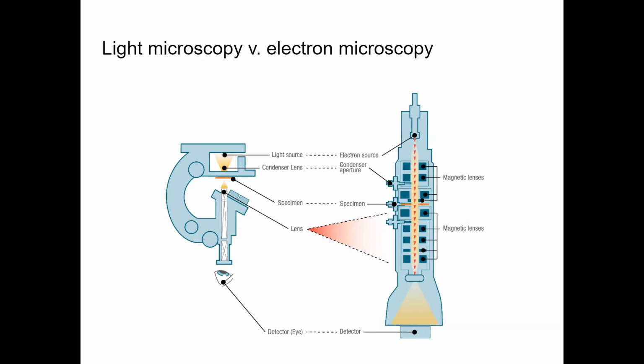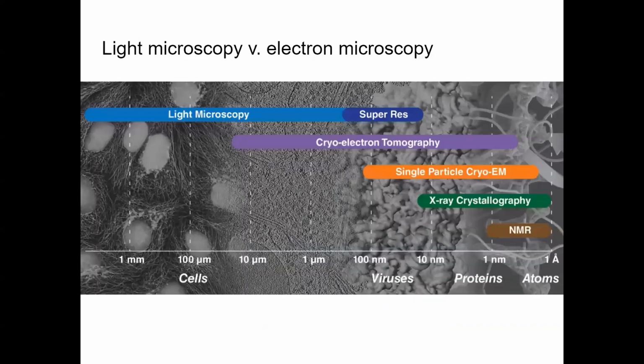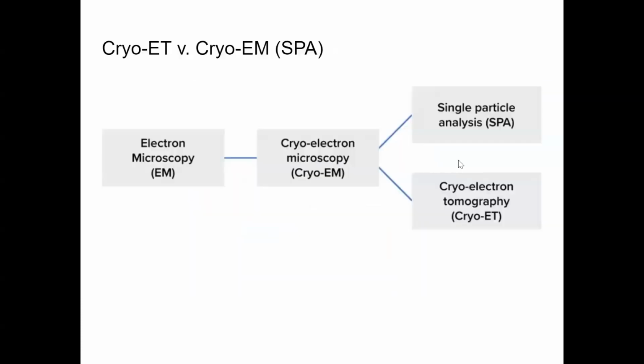Electron microscopes require putting the sample within a vacuum and passing the electron beam through it. Cryo-E.T generally uses transmission electron microscopy or scanning transmission electron microscopy to generate two-dimensional images. These two-dimensional images, or tilt images, can then be used to reconstruct three-dimensional models of the original sample, known as a tomogram.